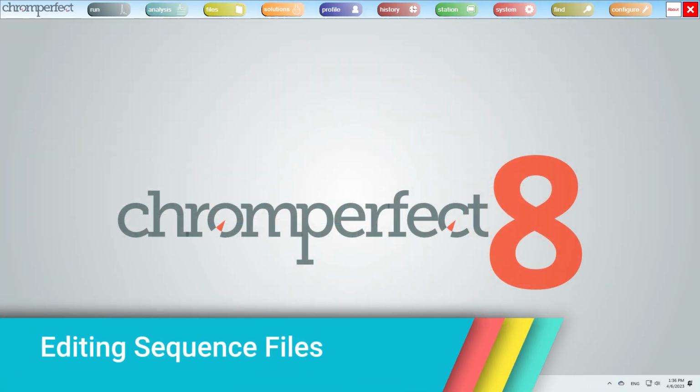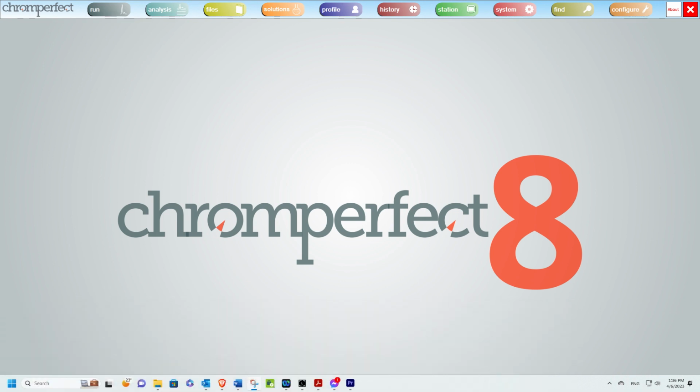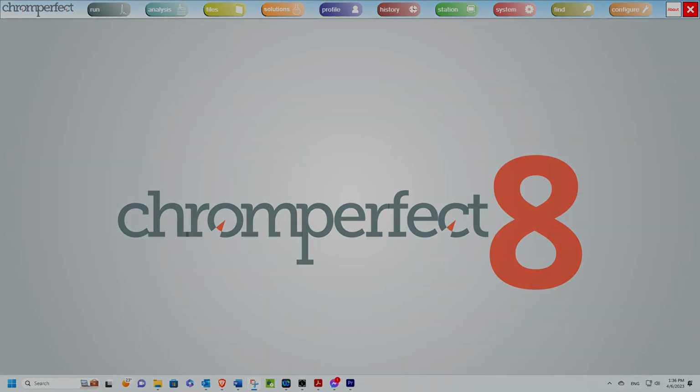Editing sequence files. There are no special considerations when the instrument has only one Chromperfect channel. But if two or more channels are involved, the sequence file must conform to the channel assignments implied by the MXC file, although not specified in it.